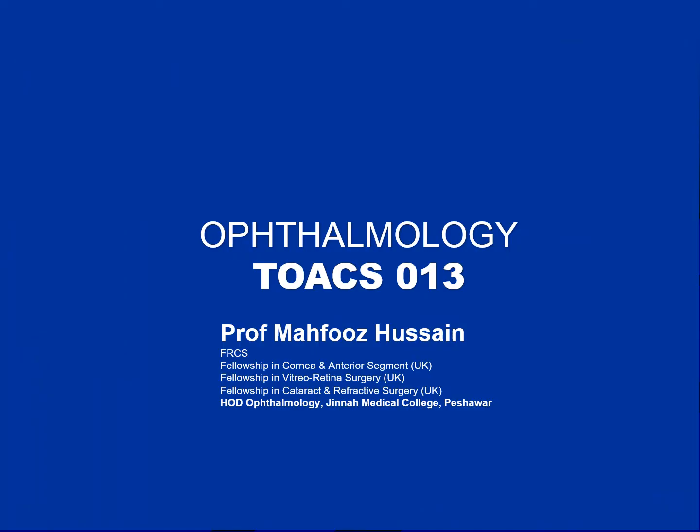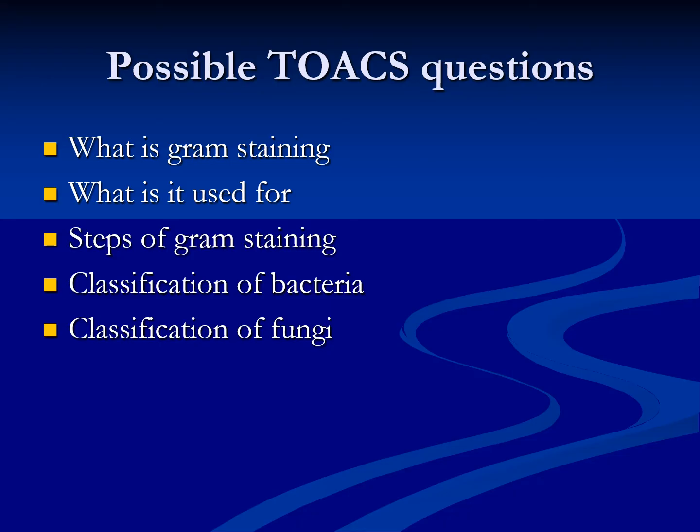This talk, number 13, is about the classification of bacteria and fungi and the gram staining. Possible questions are: what is gram staining? So you have to describe that. What is it used for? Steps of the gram staining, classification of the bacteria, and classification of the fungi. So let's start.